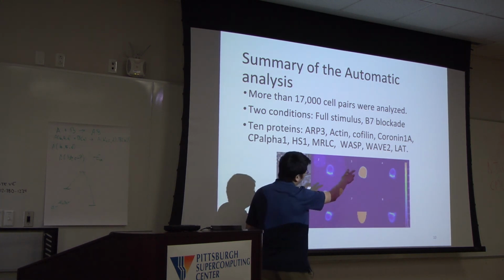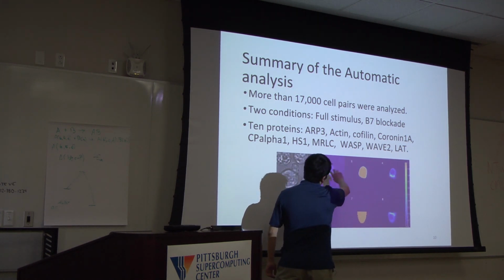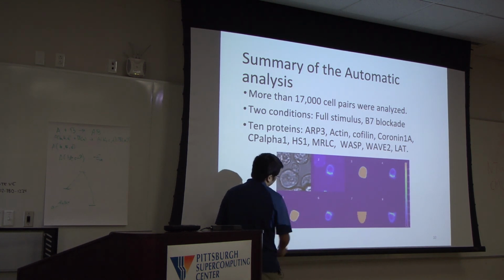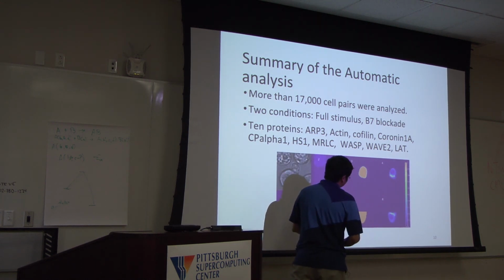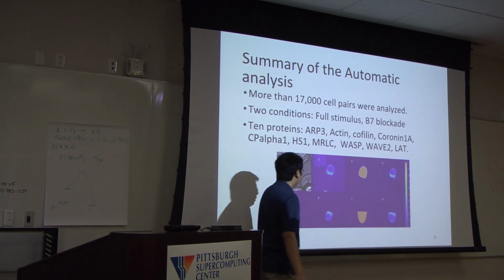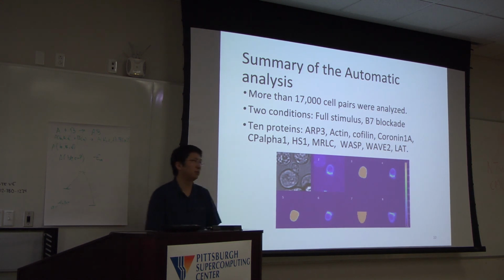And the 3 and 4 represent the segmentation. So we can see they have different orientations, but in 5 we do rigid alignment to make the synapse region face up. And in 7 and 8, they are this template, and this is the uniform shape with the intensity. Because, as I said, our images are 3D, here we only show the center slices for visualization purposes.